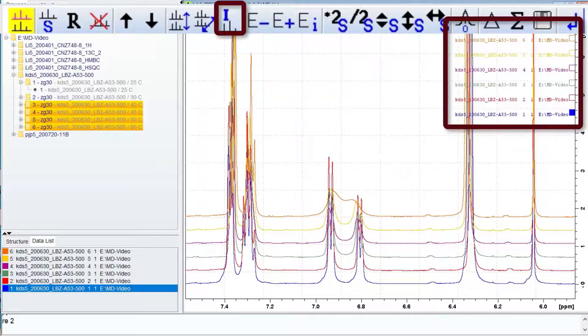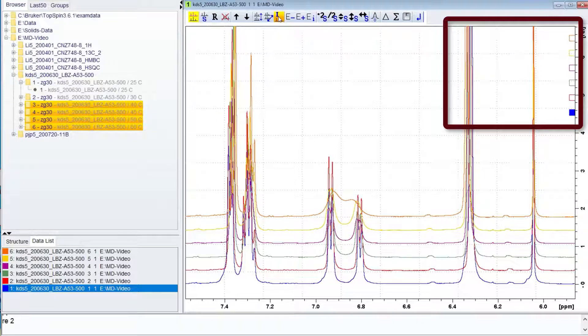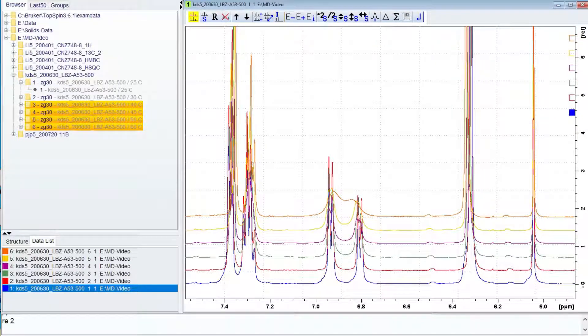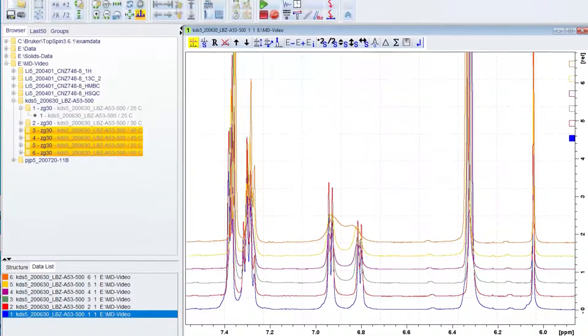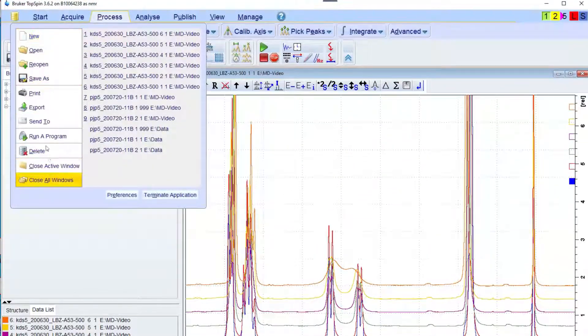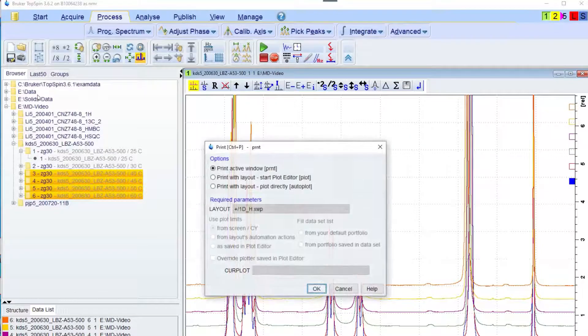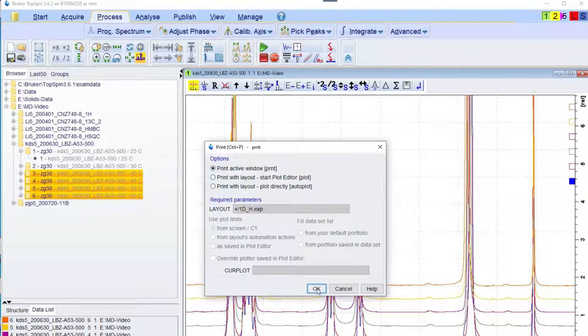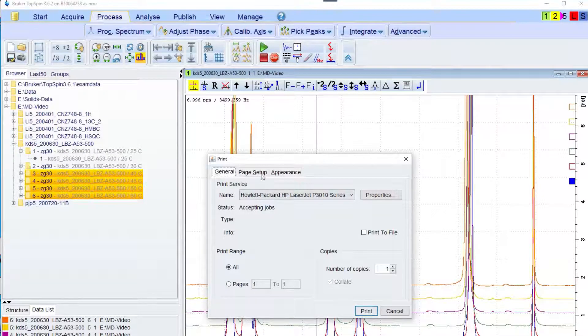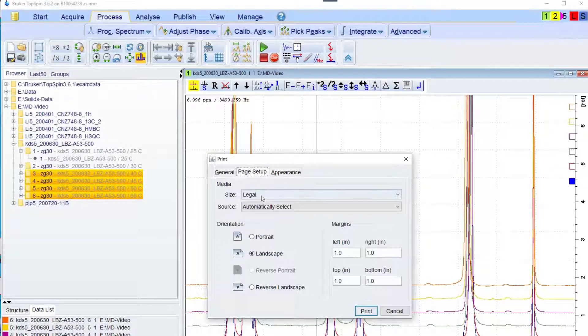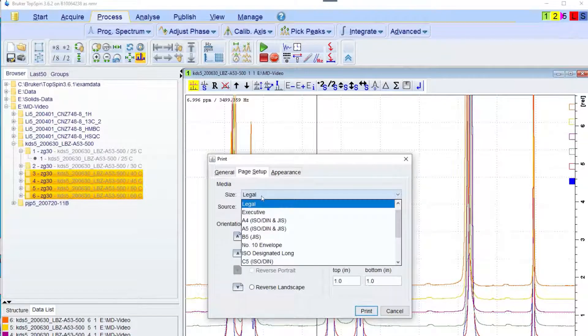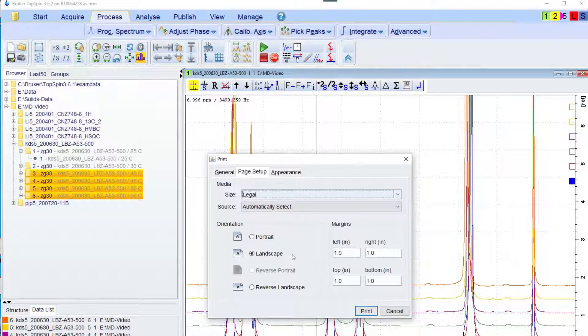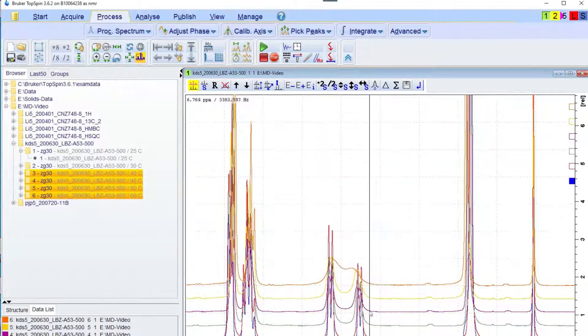The button with the eye above a trace will remove the file names from the display. This is useful if you want to get a crude printout of the results. For this you would select print from the file menu. Make sure the print active window radio button is selected and then click OK. If you are working on the facility's computers, click on the page setup tab in the print dialog box and make sure the media size is legal before clicking the print button.